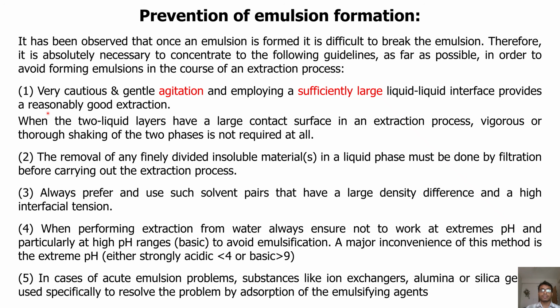Okay. So first of all, very cautious or gentle agitation and employing a sufficiently large liquid-liquid interface provide a reasonably good extraction. When the liquid-liquid layers have a large contact surface in an extraction process, vigorous or thorough shaking of the two phases is not required at all.